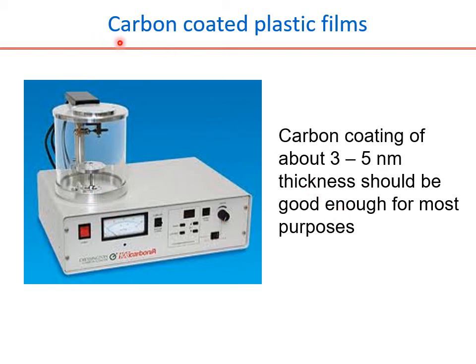And the next part, which I have not shown here, is the glow discharger. Let's spend some time on the glow discharger. Glow discharger is the one that creates some ionic centers on the carbon film. For that we need to understand what the carbon film does. So we know that the carbon film is hydrophobic in nature, and we also know that all the proteins or all the viruses that we work on are suspended in buffers. The major constituent of the buffer is water. So that means now we have two components in hand.